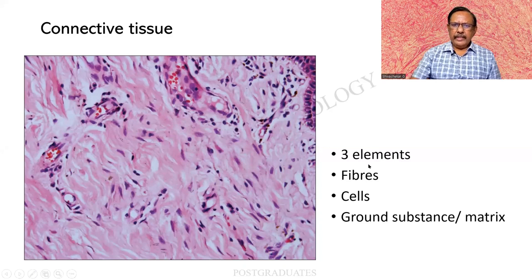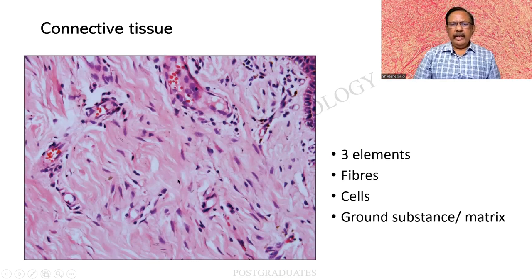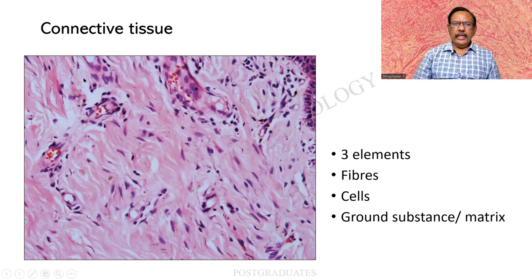There are basically three elements. One will be the fibre, two the cells, and three the ground substance or matrix. Here I am able to see delicate spindle-shaped cells which are nothing but the fibroblast. Also there are some broad ribbon-like pale structures which are the collagen fibres, and a supporting material which is the ground substance or matrix.